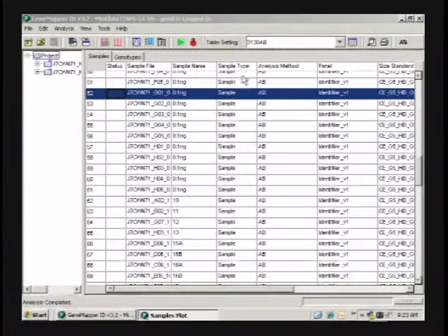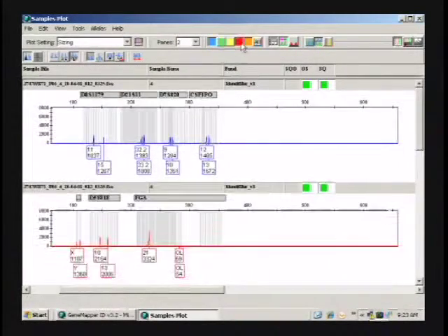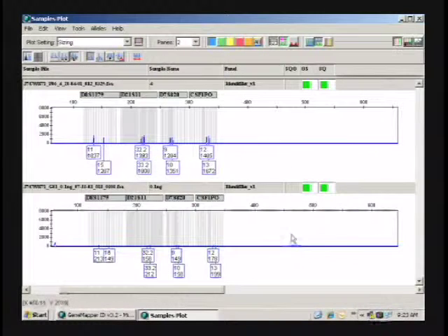So the beginning data for number 4 was at 200. It went up to 1800, and this was 2 washes. 178 went up to 1400. 200 about went up to 1600.